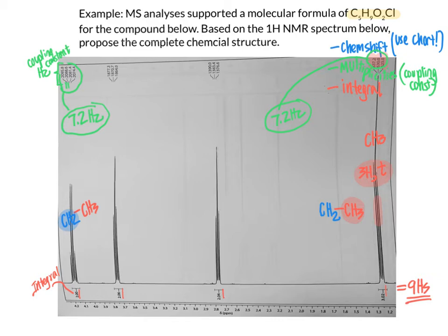So that provides additional evidence here in terms of the multiplicity, specifically looking at the splitting pattern of a triplet versus a quartet, and digging a little bit deeper just to confirm, looking at the coupling constants and finding those are the same suggests that these 2 groups, the CH2 group and the CH3, are indeed directly connected to one another. So with that then, we have our ethyl group in place within this molecule, and we have to keep piecing together what's going on here in our structure.